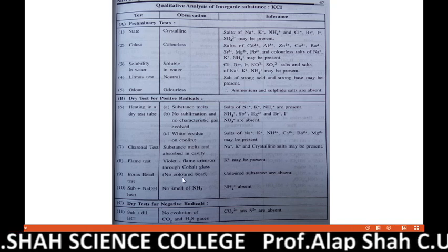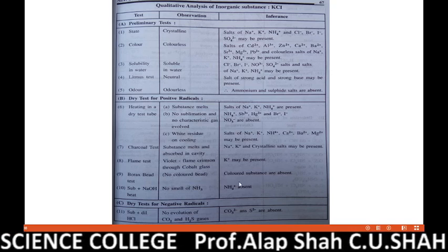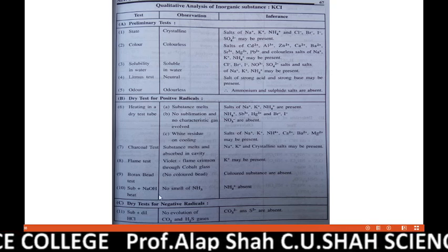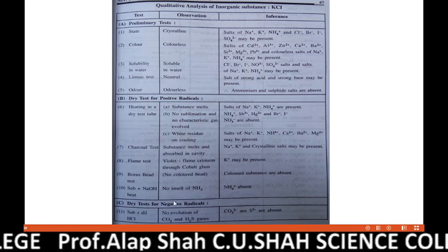Borax bead test, our compound is colorless, so there is no need to perform this test, but you should write everything. We perform it only when the powder is colored. And test for NaOH, NH4 plus, it is absent. So these 4 tests are the dry tests for positive.